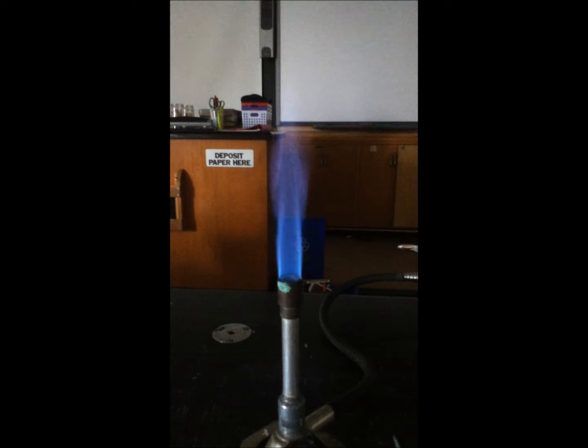This is the second video where we're looking at the color that various metal solutions will produce when they're burned. You can do the same thing with powders, but here we're just going to look at some solutions. We've got some potassium chloride, so we're going to see what potassium does when we burn it.